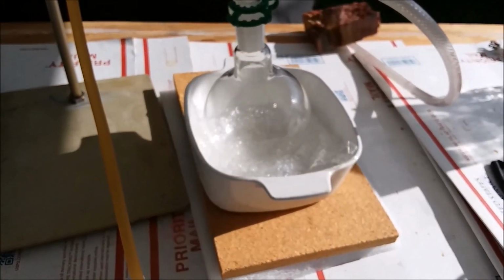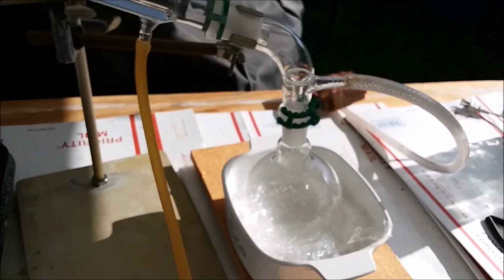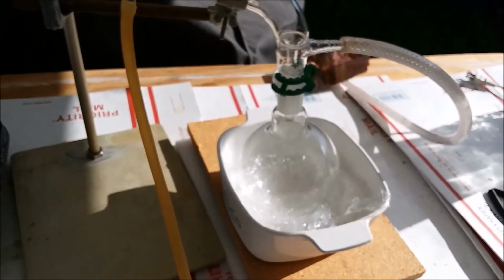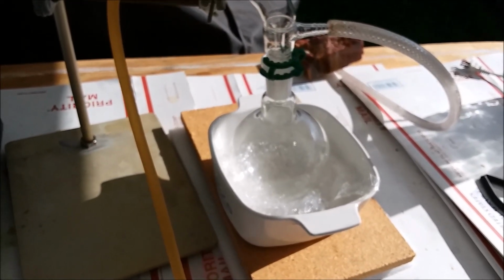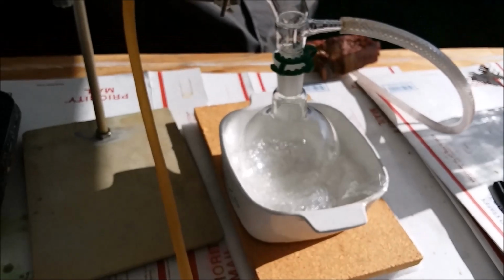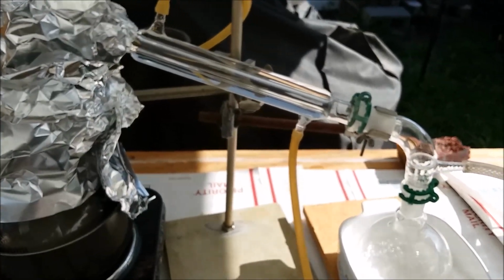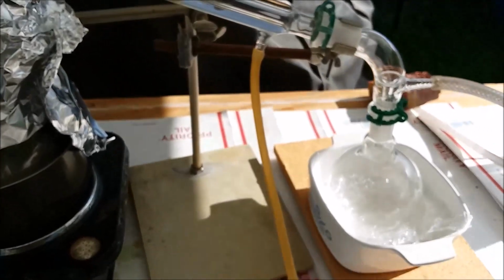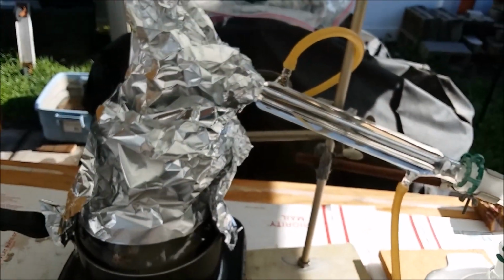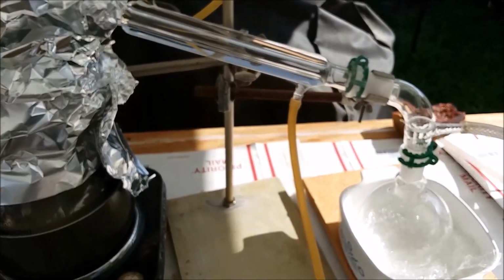Also, I've put some support under the receiving flask in case the keck clip fails. I don't want the receiving flask falling off and dumping nitric acid all over the place and probably rolling off the table and breaking. And we know from my previous videos that making nitric acid is tough on keck clips.